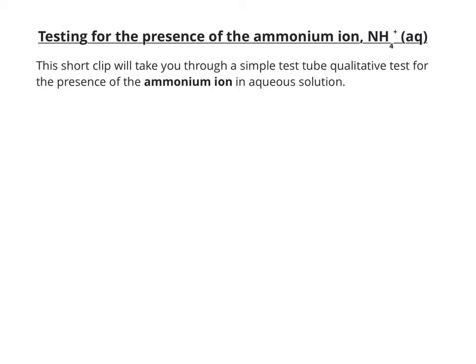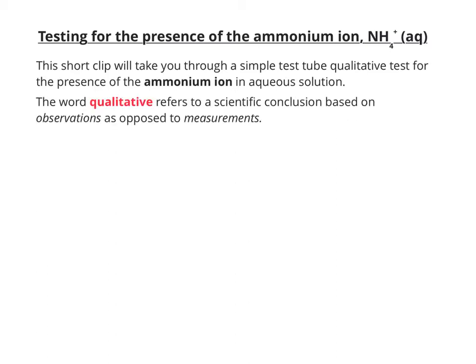Hi, and welcome to this clip which goes through a simple test tube qualitative test for the presence of the ammonium ion in aqueous solution. The word qualitative refers to any scientific conclusion that's based on observations that are made, as opposed to measurements that are taken.